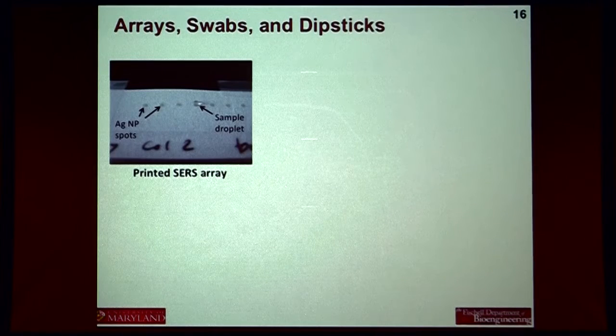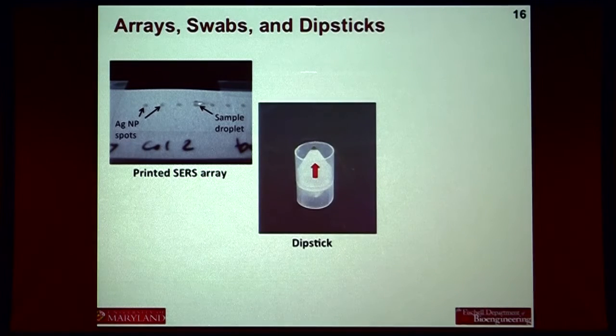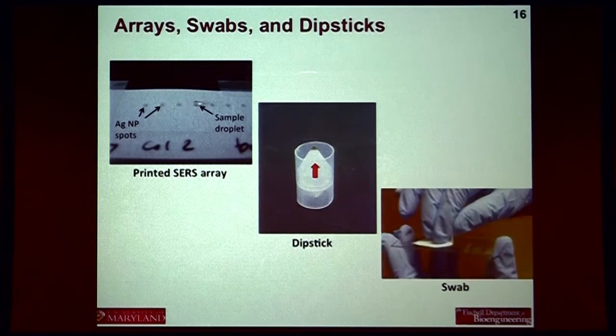So this really just illustrates a very simple idea of replacing that commercial sensor just by printing one out on paper and using it that way. But that doesn't really capture what I like the most about using paper, actually. It's cheap. That's nice in one sense. But where paper really surpasses those rigid devices is in its ability to move fluids and in its ability to be flexible.